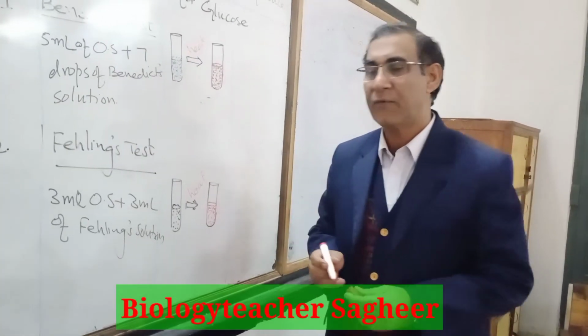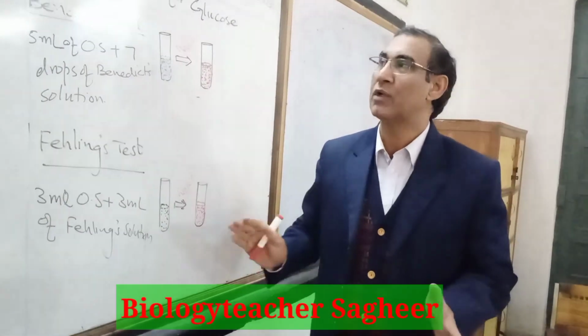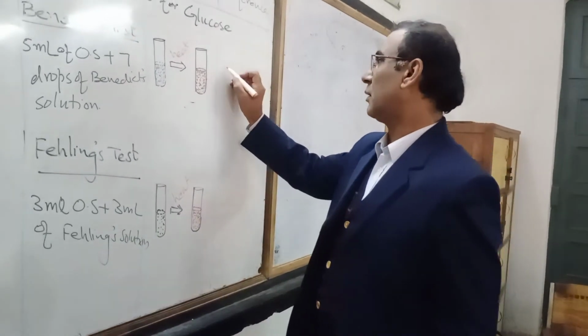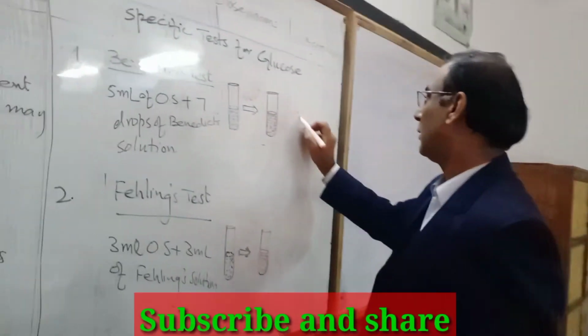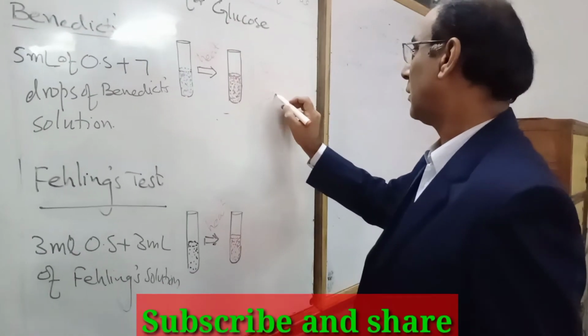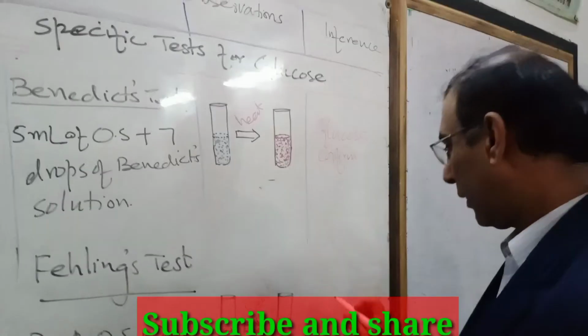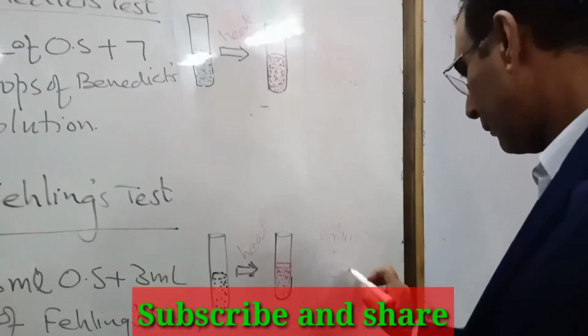That would confirm the presence of glucose in the given solution, and you would write the conclusion here: glucose confirmed. Okay, here again, glucose confirmed.